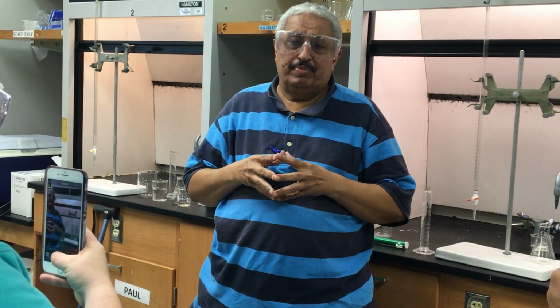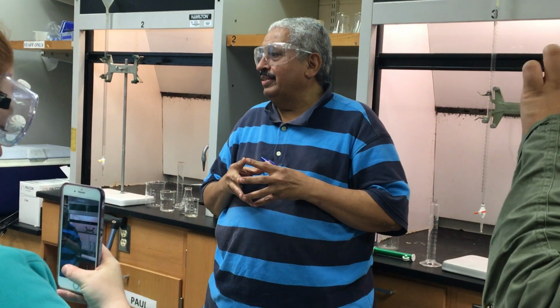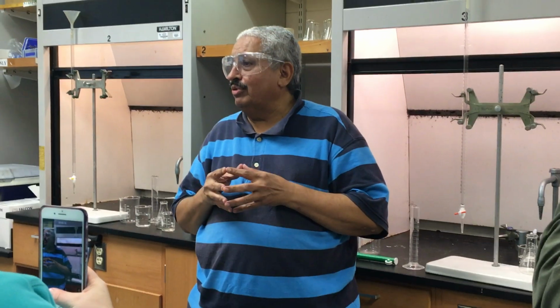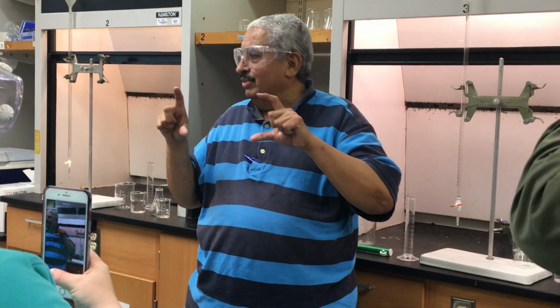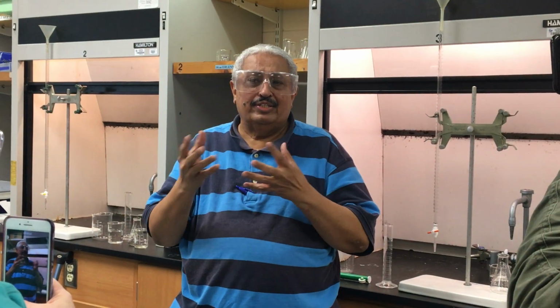The experiment is acid-base titration. So a base is recognized as what? A base accepts protons from an acid. An acid donates protons to the base. Now, if I have two bottles, one acid and one base, how can I recognize them?